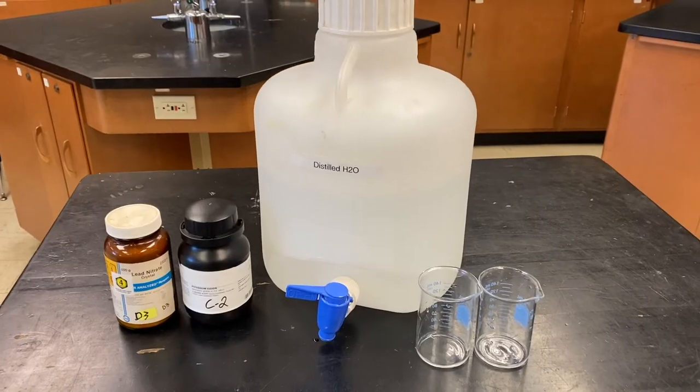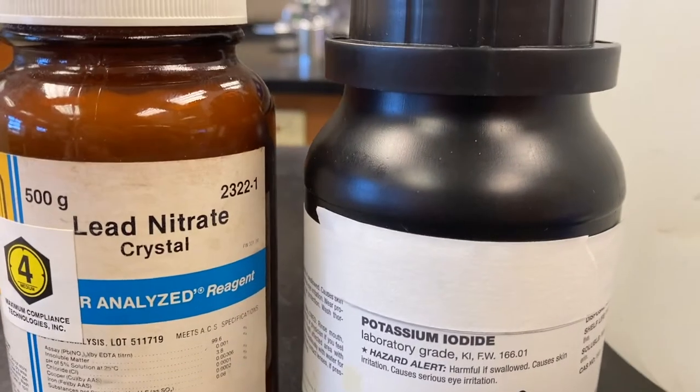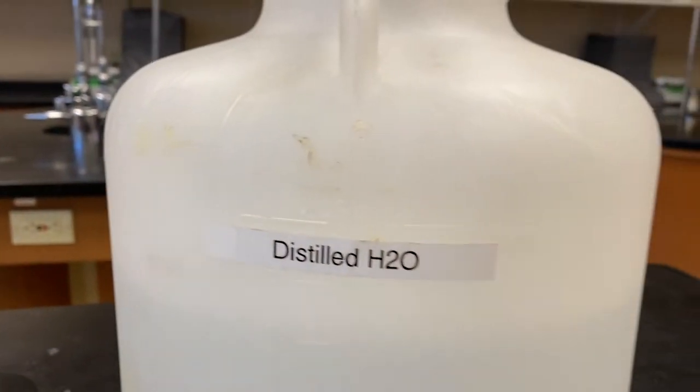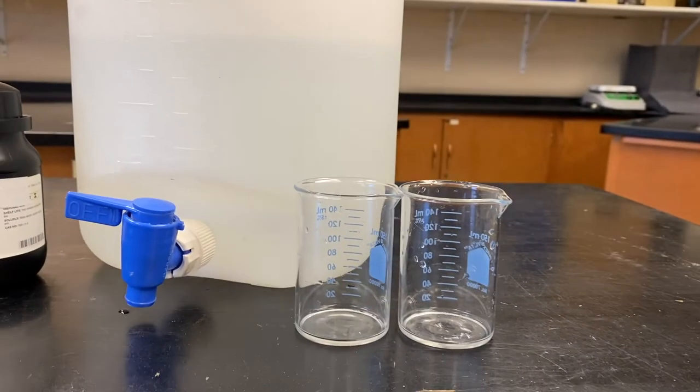Here's what we're gonna need for this experiment: we need lead nitrate, we need potassium iodide, we need distilled water, and we're gonna need a little bit of glassware.